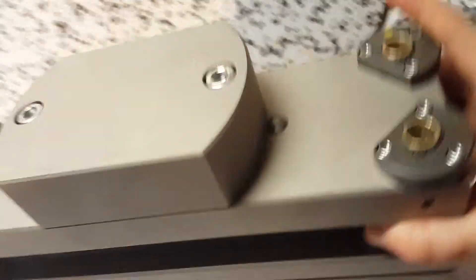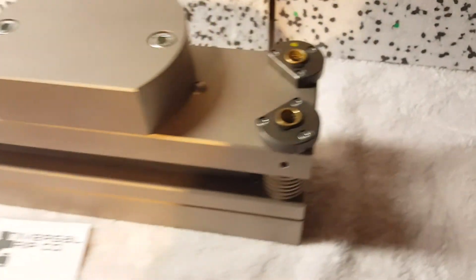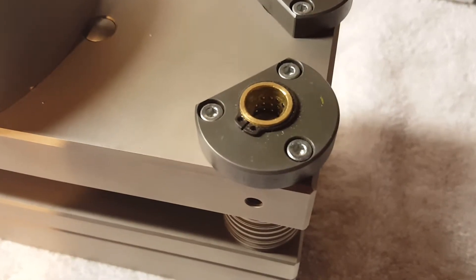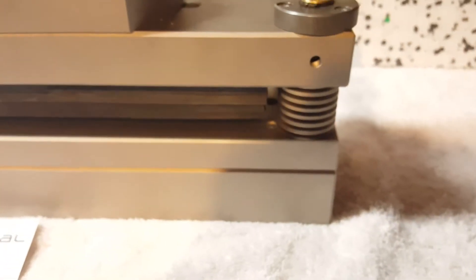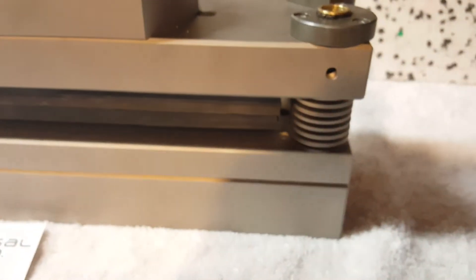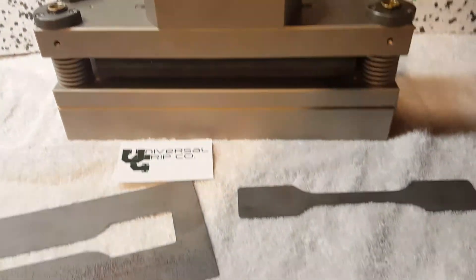This top piece, or the top pressing section, slides along these rails here. There are ball bearing bushings in there, and as it pushes down, these washers almost act as a springing mechanism — they spring the whole thing back into place after you stamp the sample.